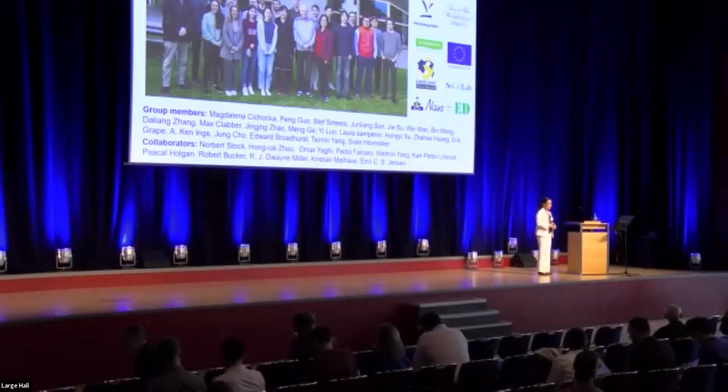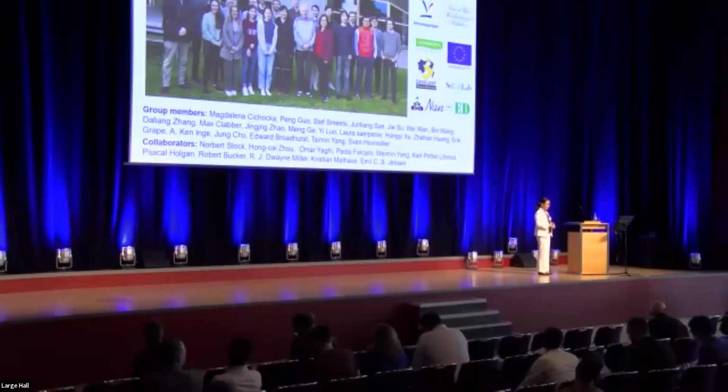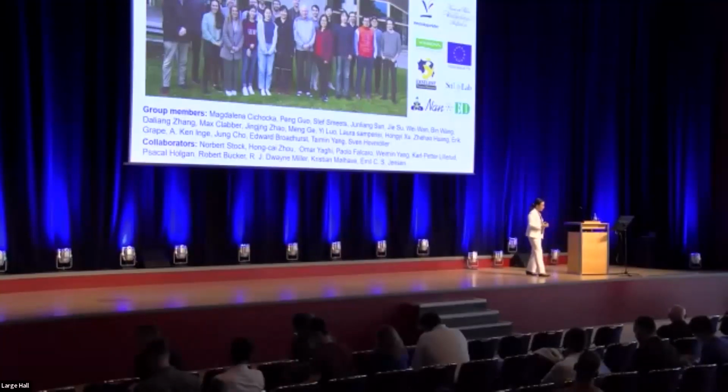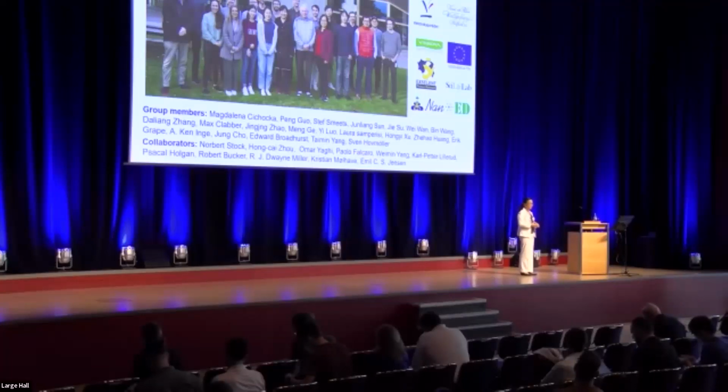Thank you. We'll take one final question. Also, many thanks from my side for this brilliant presentation and all the opportunities you're offering to our community. You have omitted one special topic, namely absolute structure determination. Is it possible also to distinguish enantiomorphic forms of crystals? Yes, so I haven't had time to talk about it. If you want to determine the absolute structure, then you need to apply dynamical refinement. And so it's possible. We have done it in collaboration with Lukas Palatinus on many different types of structures. Thanks a lot. I encourage you to applaud once again Professor Zou.